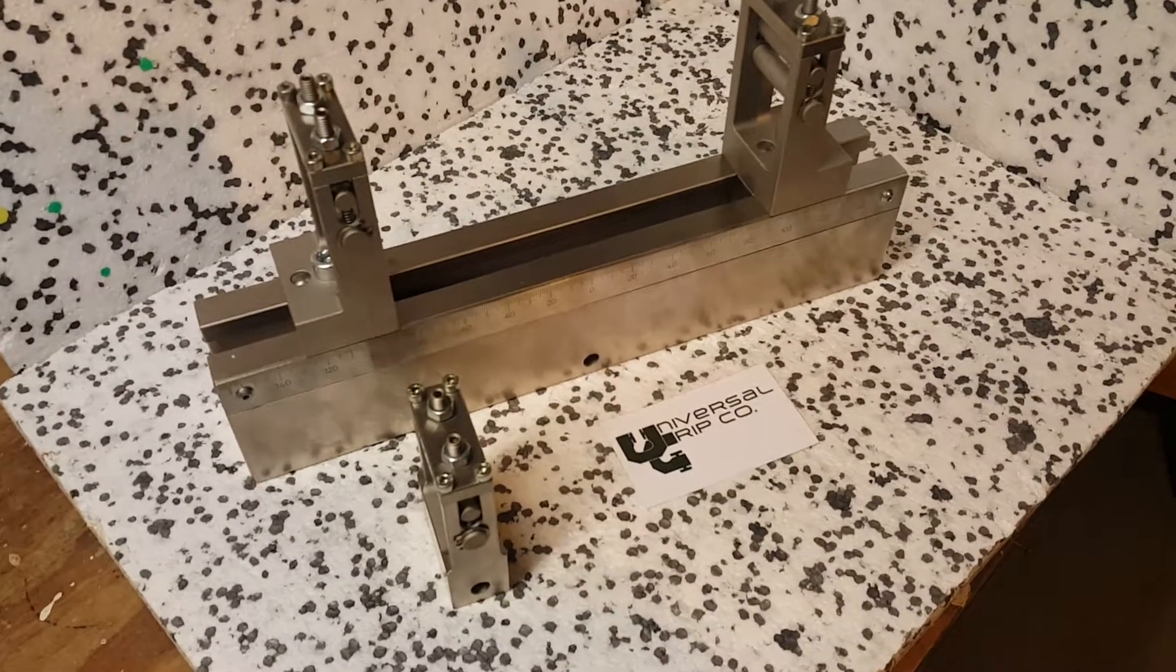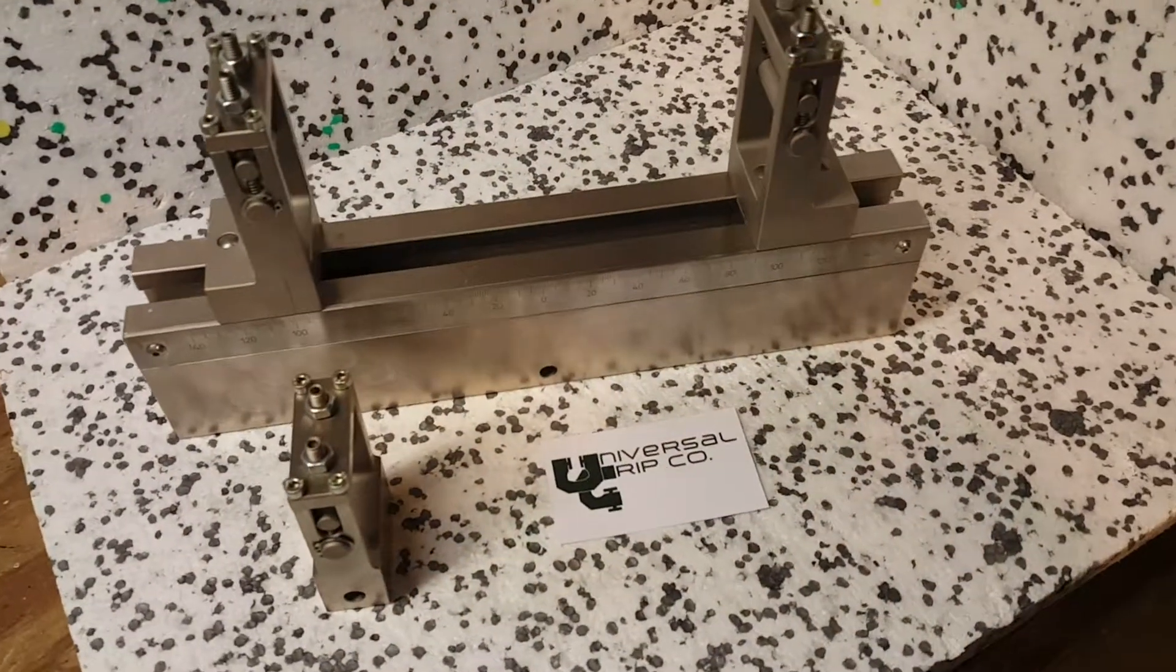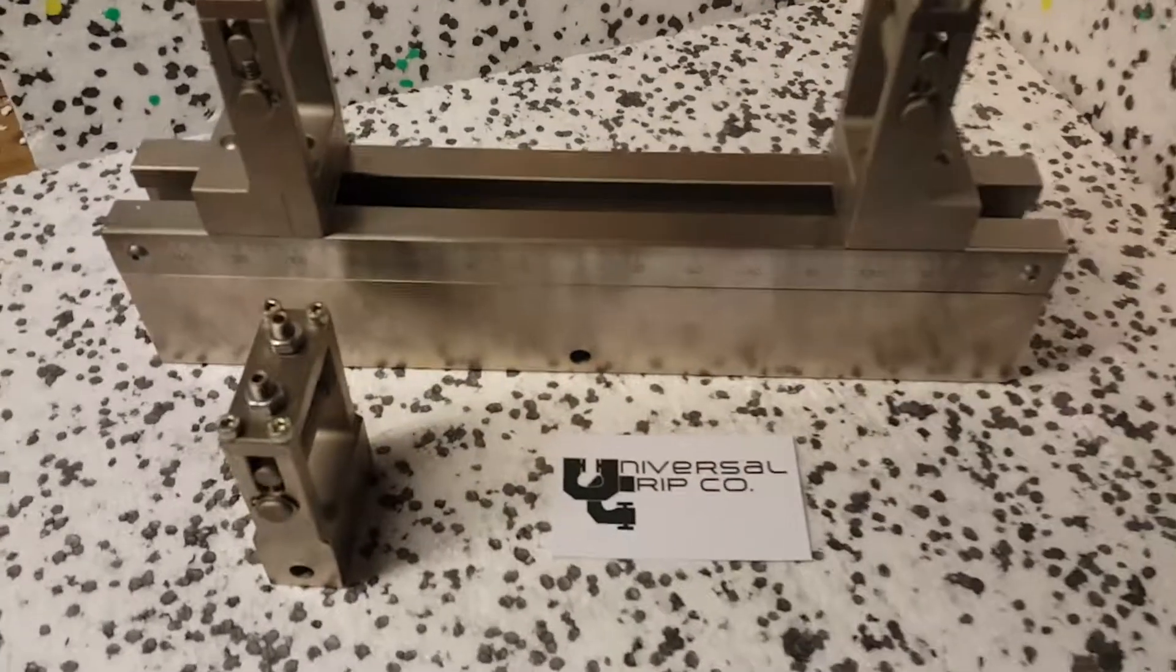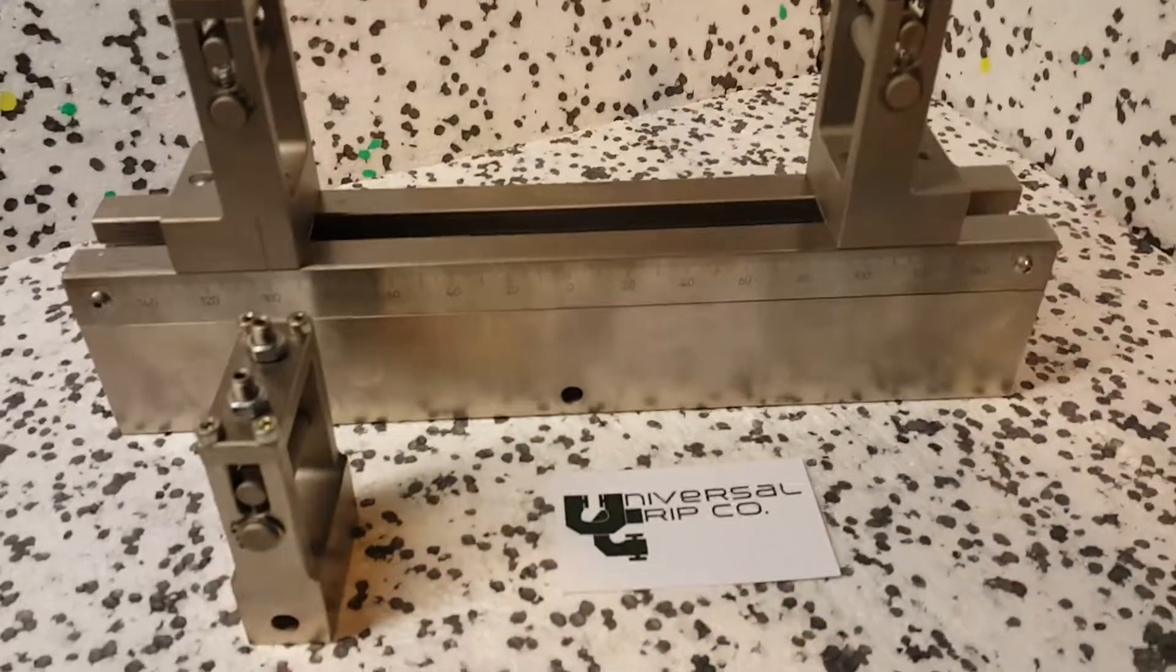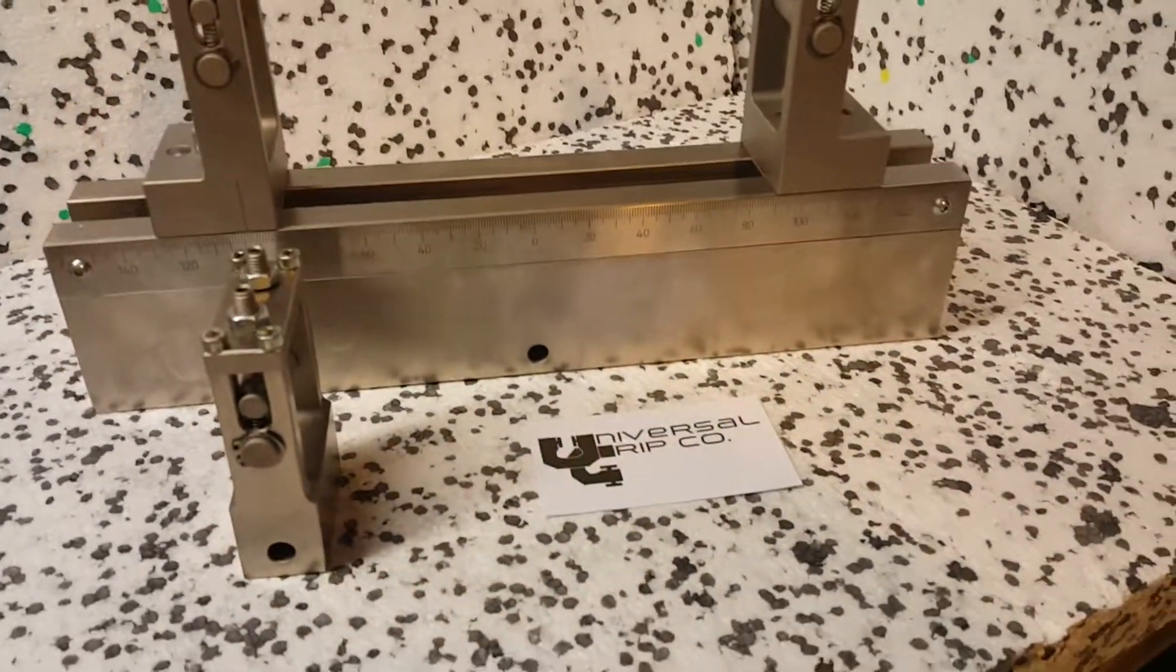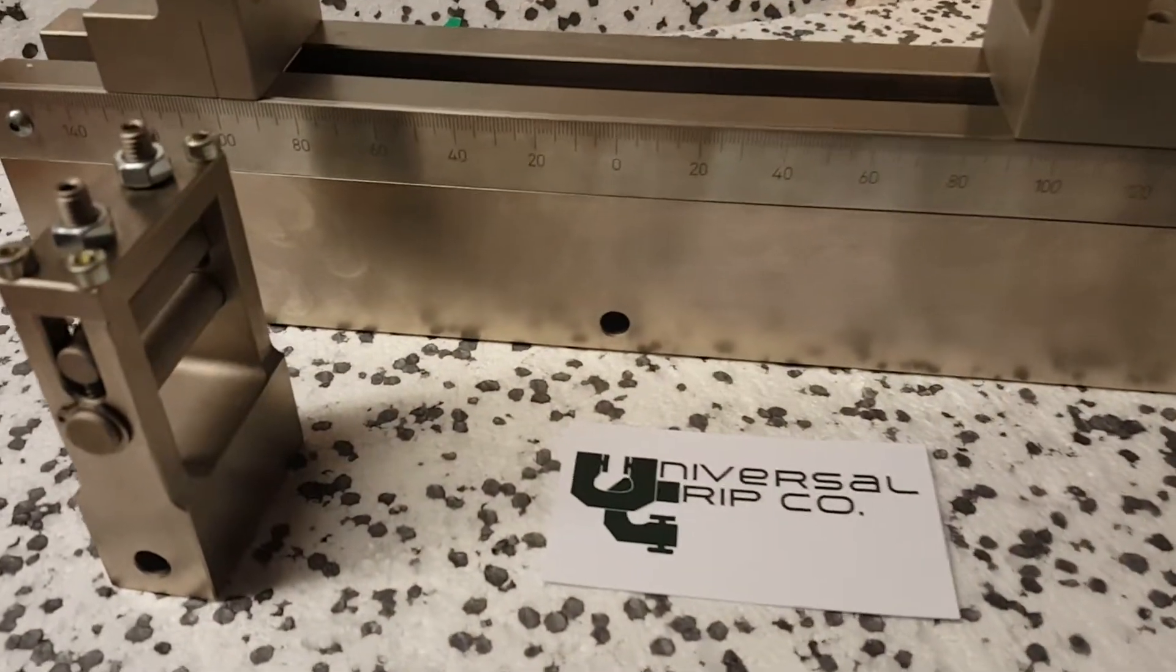Hello everyone, today we're showing the ASTM D7774 bend fixture. This bend fixture is for doing flexural fatigue testing on plastics.